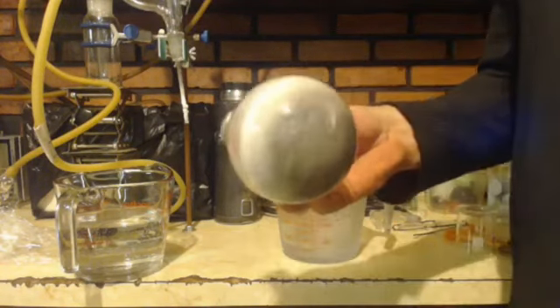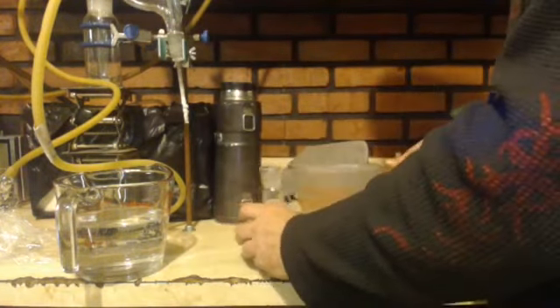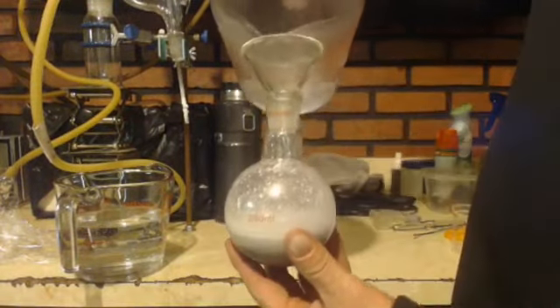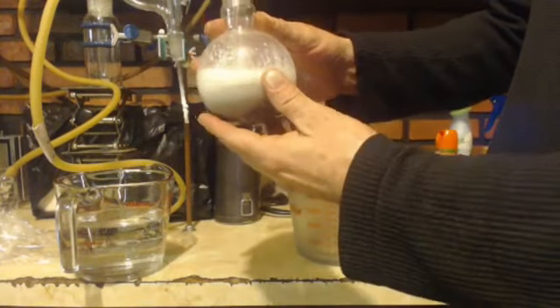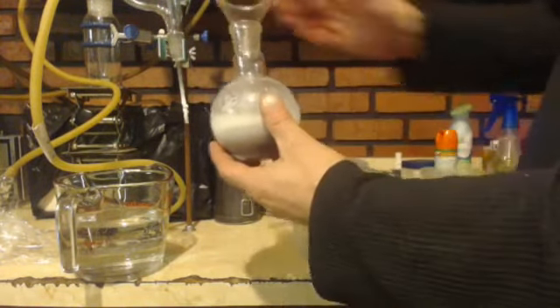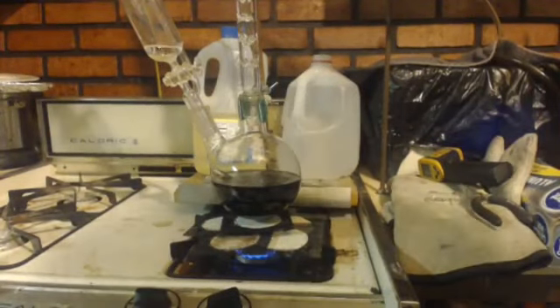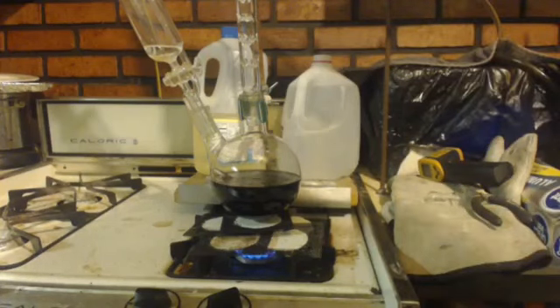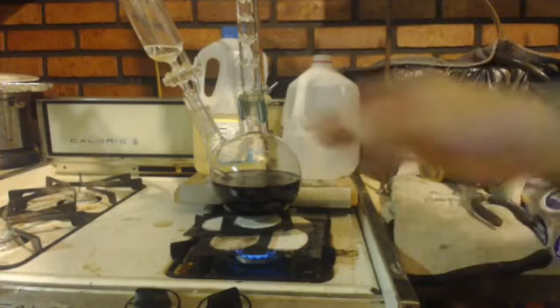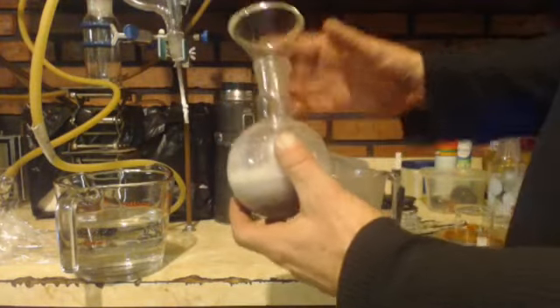It's frozen up. I should have used more diethyl ether, but okay, well, I'm going to pour it into here then. Oh crap, it's boiling. I forgot about the magnesium. Since the magnesium's in there, when I put the hydrochloric acid in, it's making hydrogen. The hydrogen is splurting out, like spraying out of the bottle, carrying HCl with it, on my hand and that. That's why I stopped. It's stinking up the place.